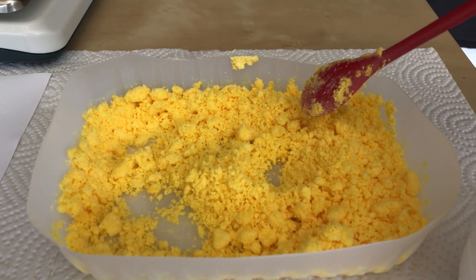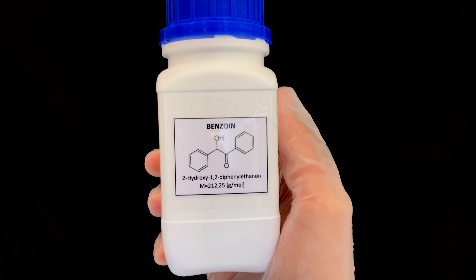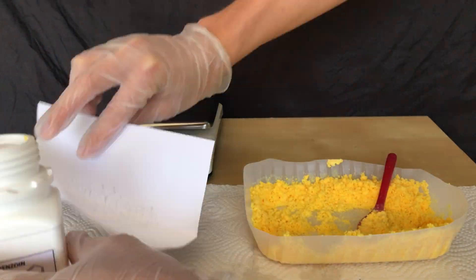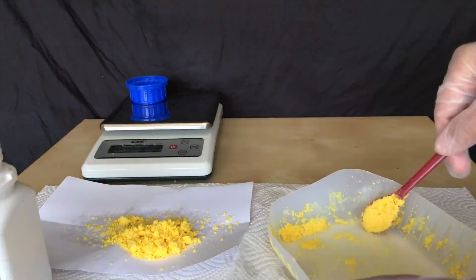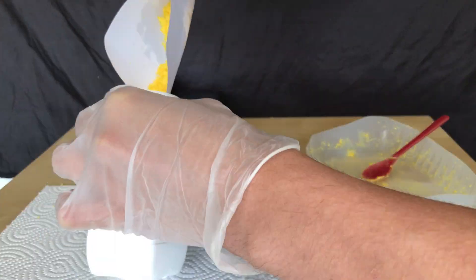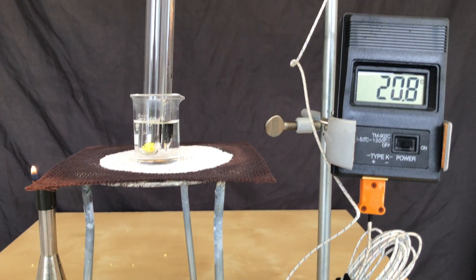The next day the powder looked dry but it was still a little bit wet. I still decided to transfer it to a storage bottle. The container was weighed in advance to determine the yield. We ended up with 98.6 grams, which represents a yield of about 94%. Because it is still slightly wet, the real yield is likely between 85 and 93%.